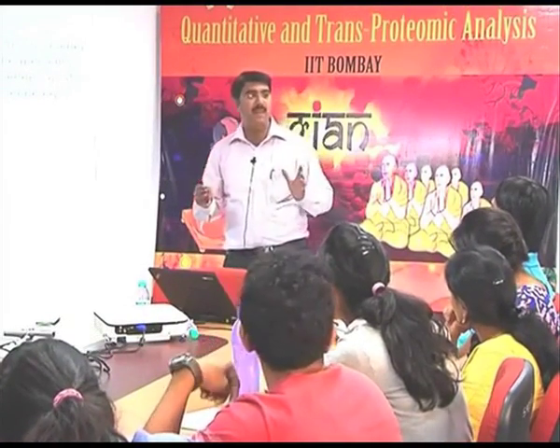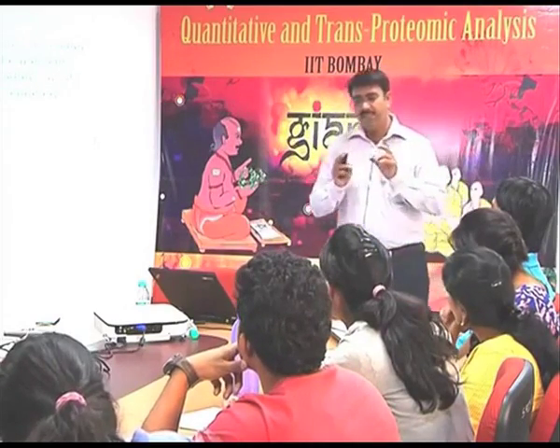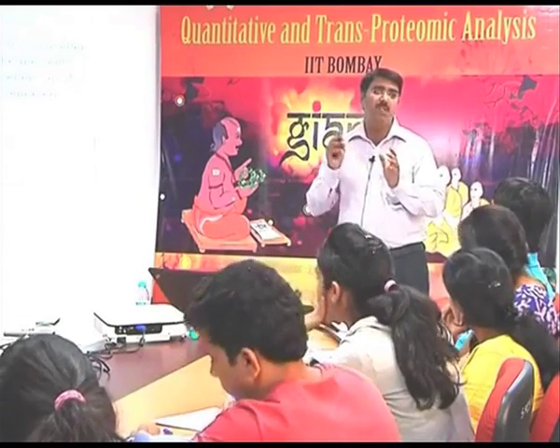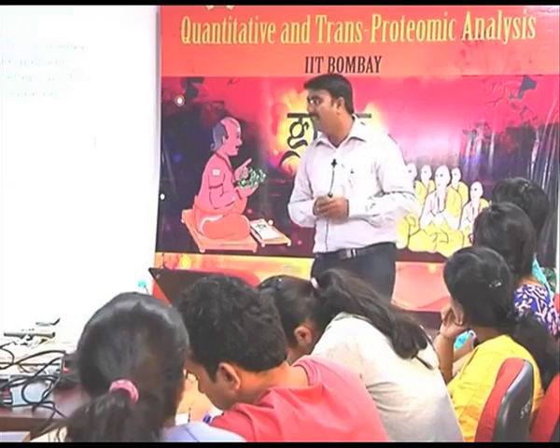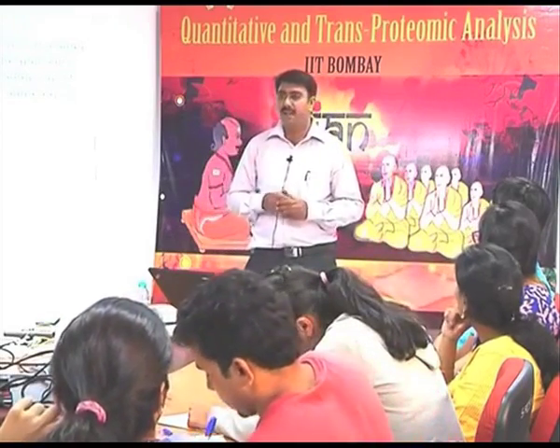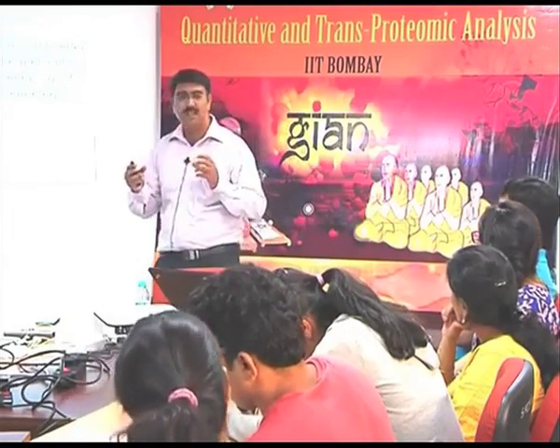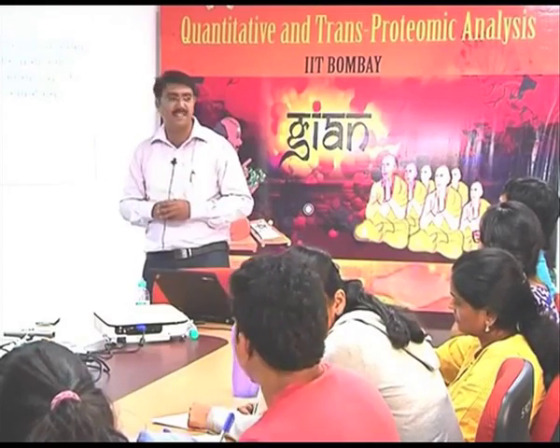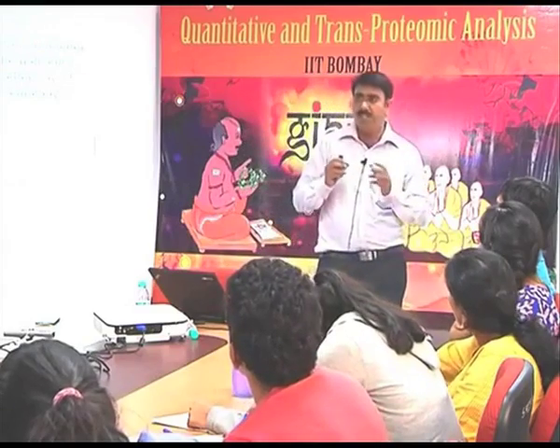Here, where label free detection comes in, there is a different concept: solution interface and solution solid interface. These are the two techniques. You have heard about ITC, isothermal titration calorimetry, where if two proteins are interacting together, what energy is absorbed or released in the reaction system. This we call a solution interface.